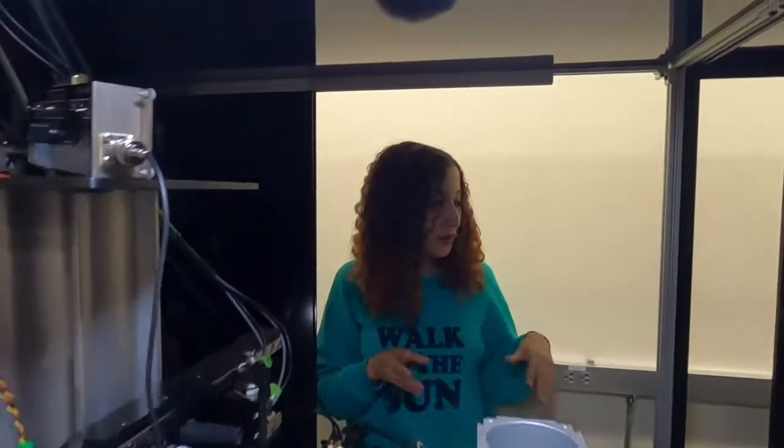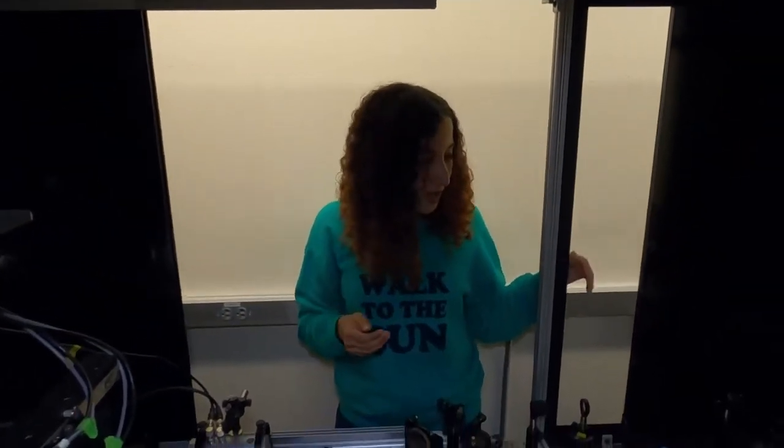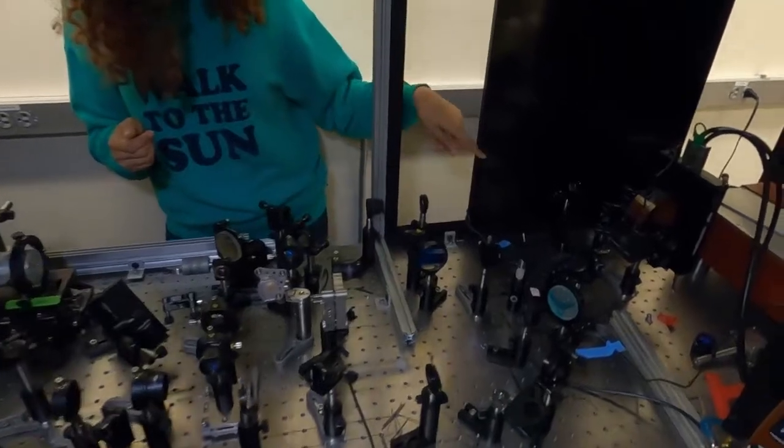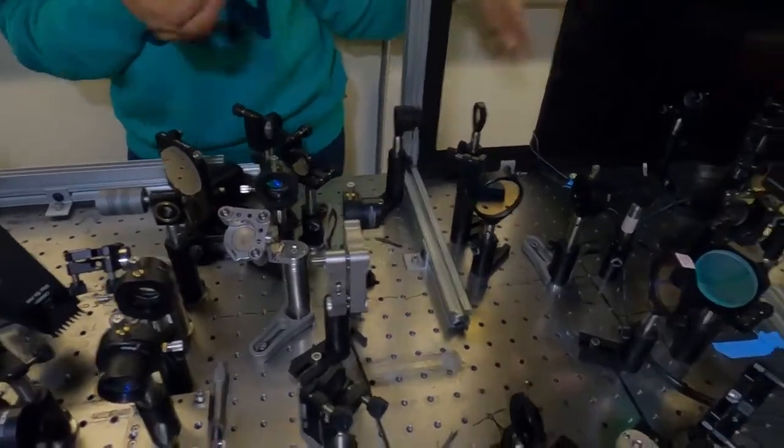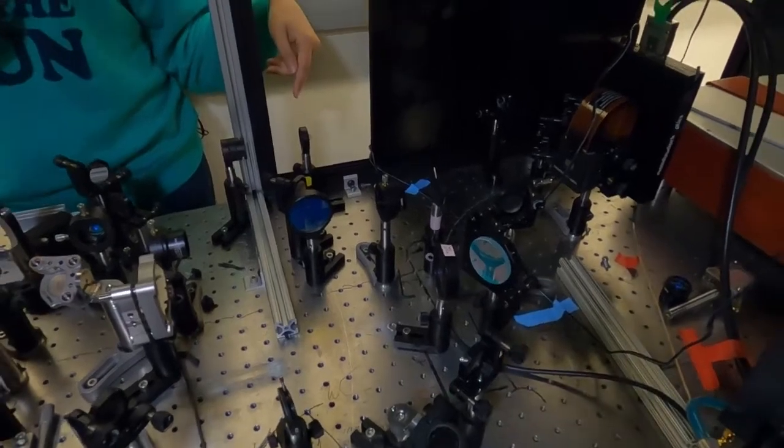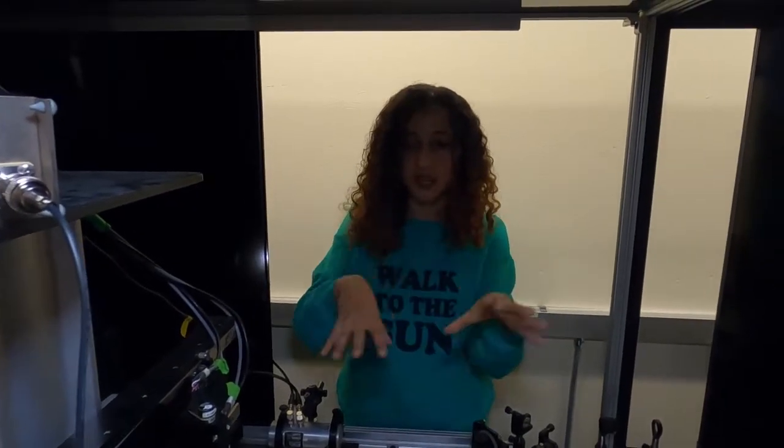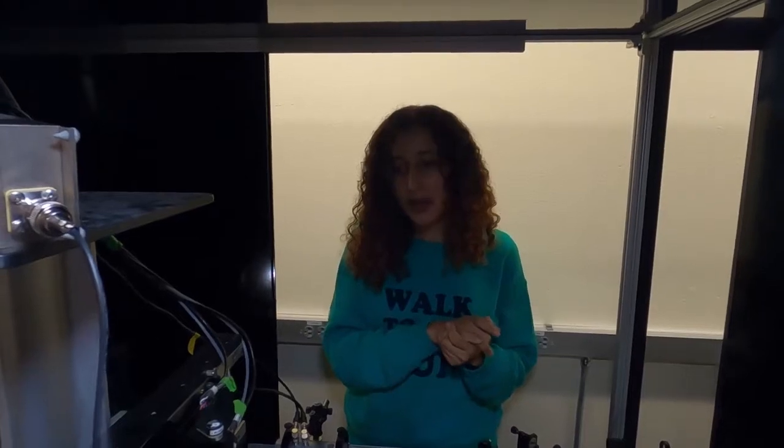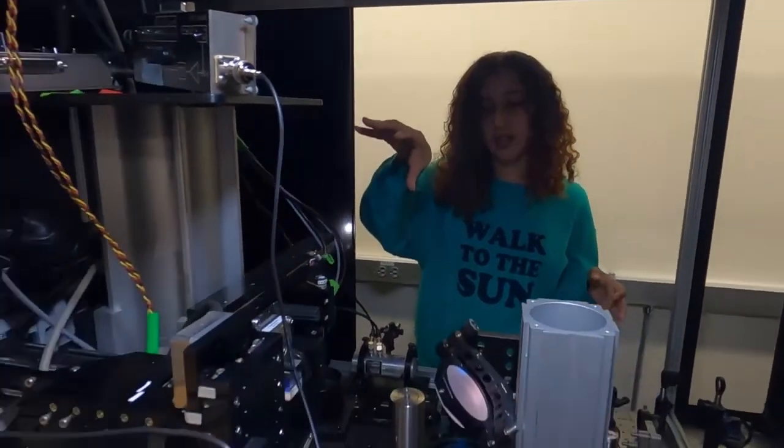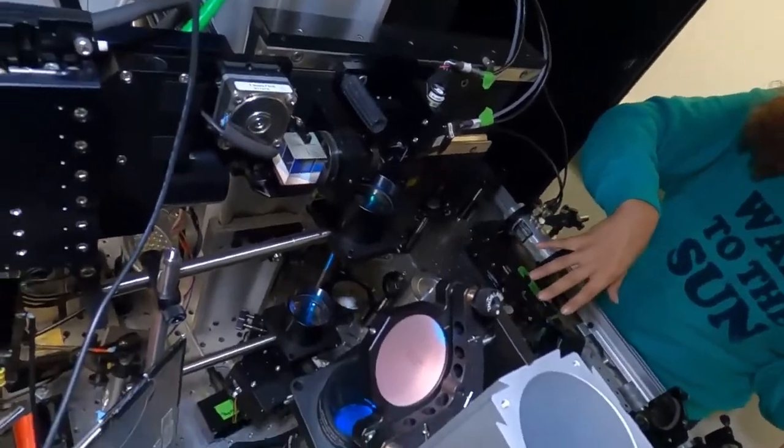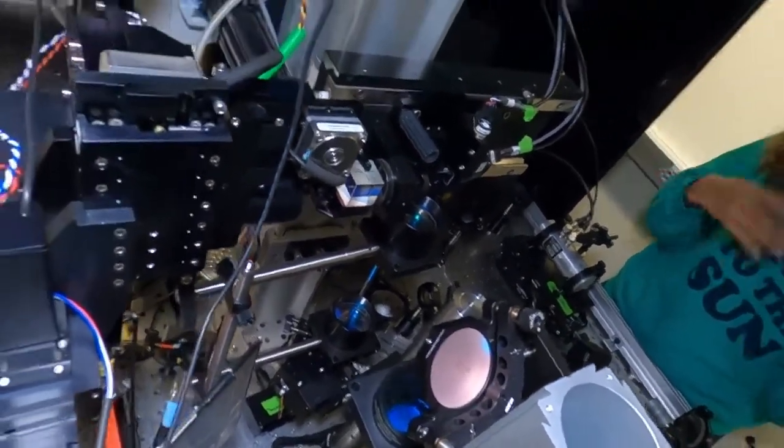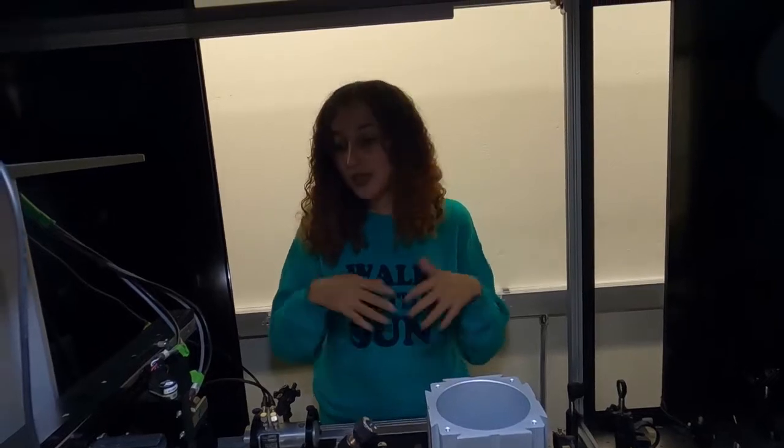And then we also have other more exploratory experimental paths. Like this path for example, where we're playing a bit, we're doing some phase shaping for other types of volumetric systems. And yeah, that's pretty much it. The last perk maybe of this system is that we had made this custom scan system where we both have a Galvo-Galvo system upstairs. And then downstairs we have a resonant-Galvo. So this allows you to use either or, or you can use them simultaneously and be able to do multi-region resonant scanning. So this Swiss knife microscope, as I said, is used in many projects from spines to circuits to behavior. And Mora is going to show you an example of the system in action.